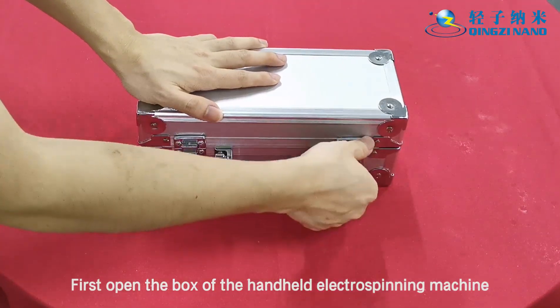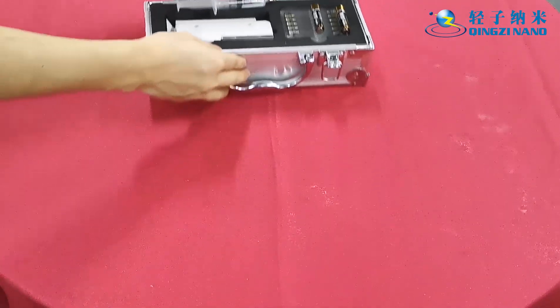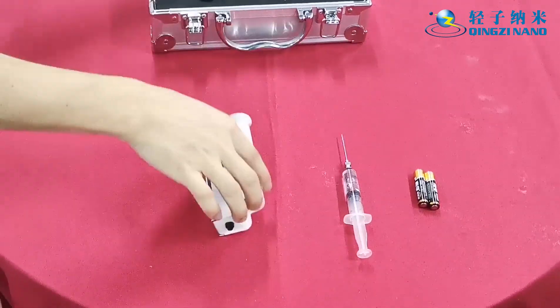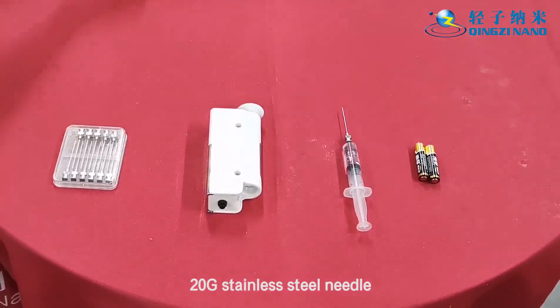First, open the box of the handheld electrospinning machine. Contents include 2 AAA batteries, a 5 milliliter standard syringe, the handheld electrospinning apparatus, and a 20G stainless steel needle.